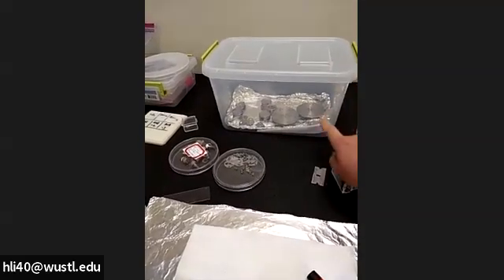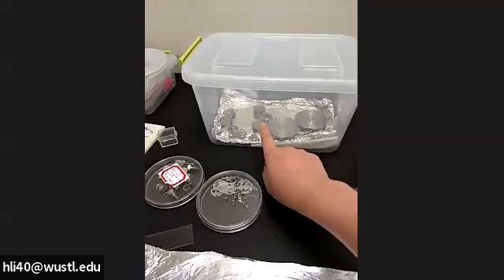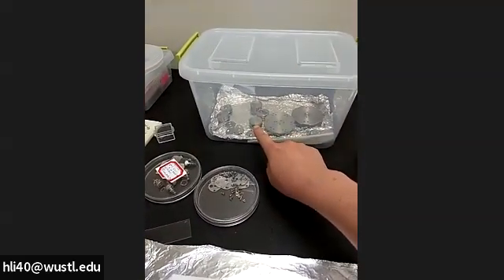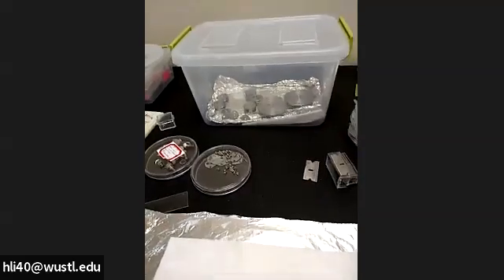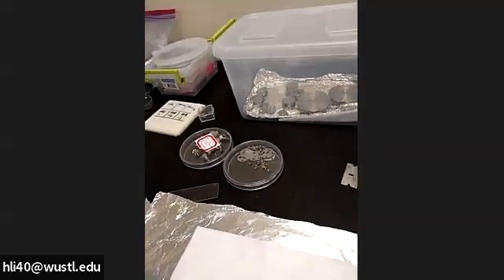We have a 60 millimeter holder — you can see two of them — and many 25 millimeter holders. Make sure you wear gloves, because all these items we're going to handle require gloves.